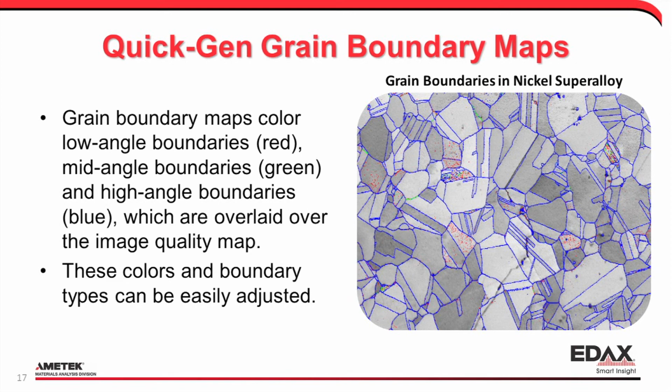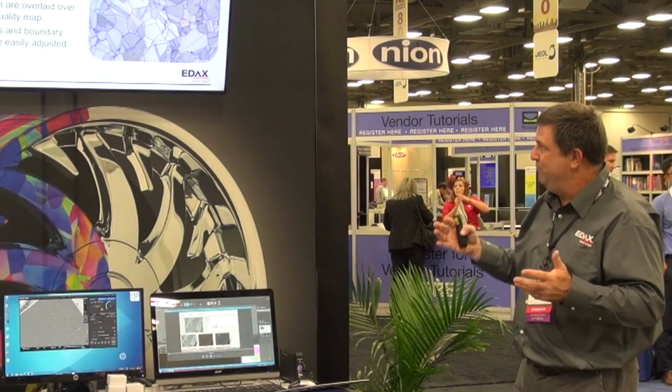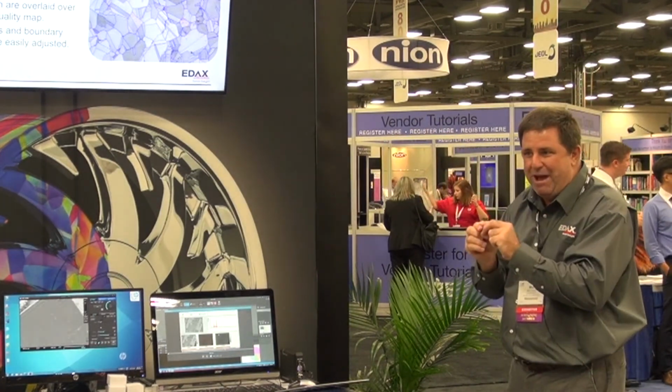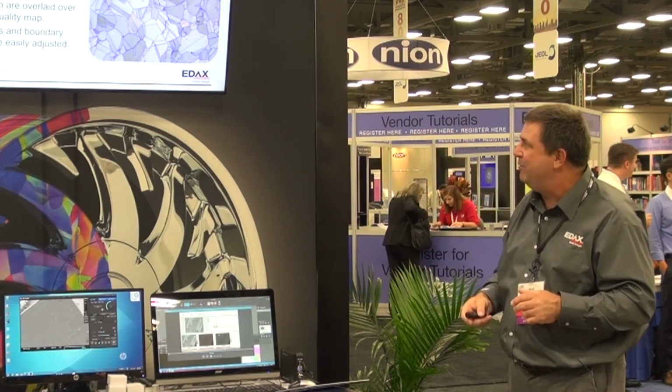We can measure lots of grains, and we measure lots of grain boundaries. So compare that to a TEM when we're looking at usually 1 or 2 or 3 boundaries. Here we get a large number of statistics as part of the acquisition.